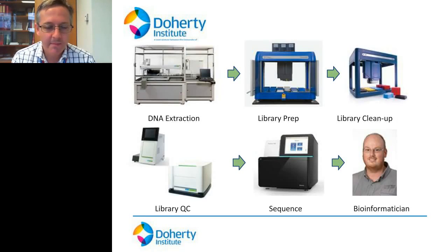So just as an example from our own point of view, how do we set this up in a public health laboratory? Well, it's not straightforward actually, and it's required a lot of investment in hardware. This is robotics and automated DNA extraction and various library QC modules that are required before you can place your sample onto the genome sequencer. These are the sort of things that might be required for a laboratory that is considering transitioning to a sequencing-based approach.